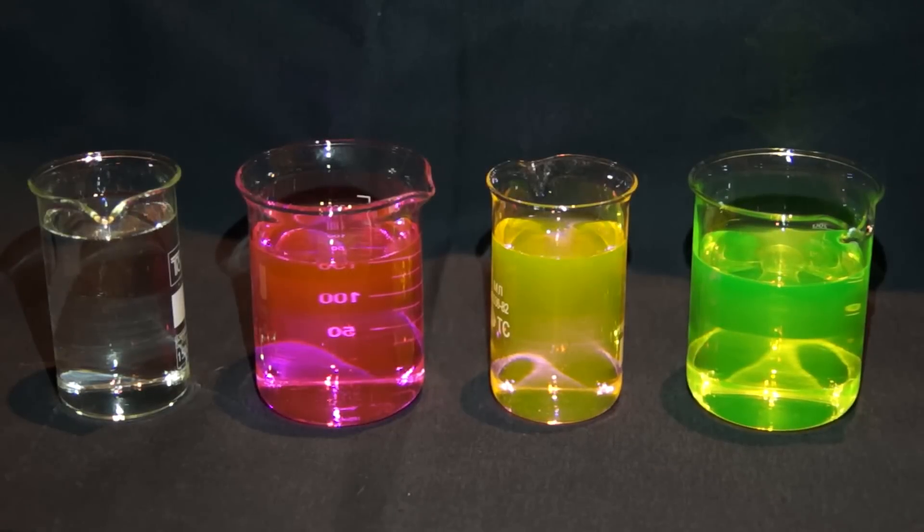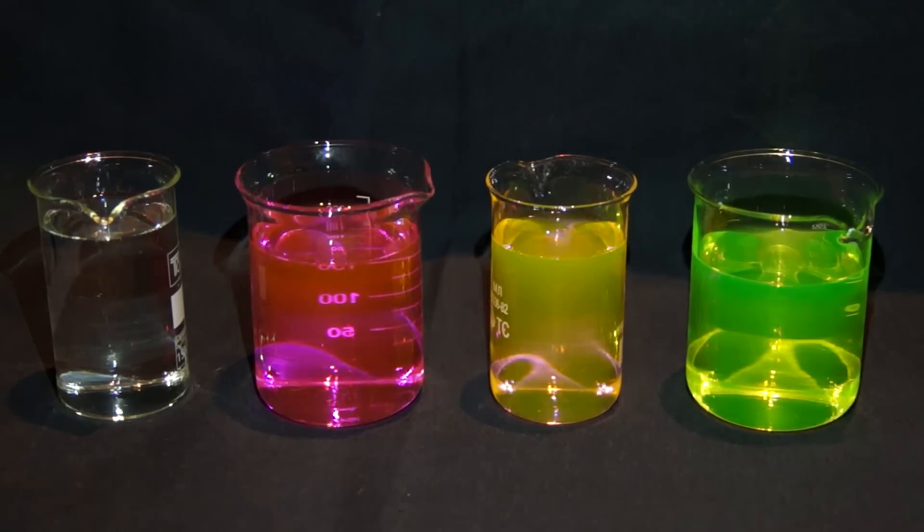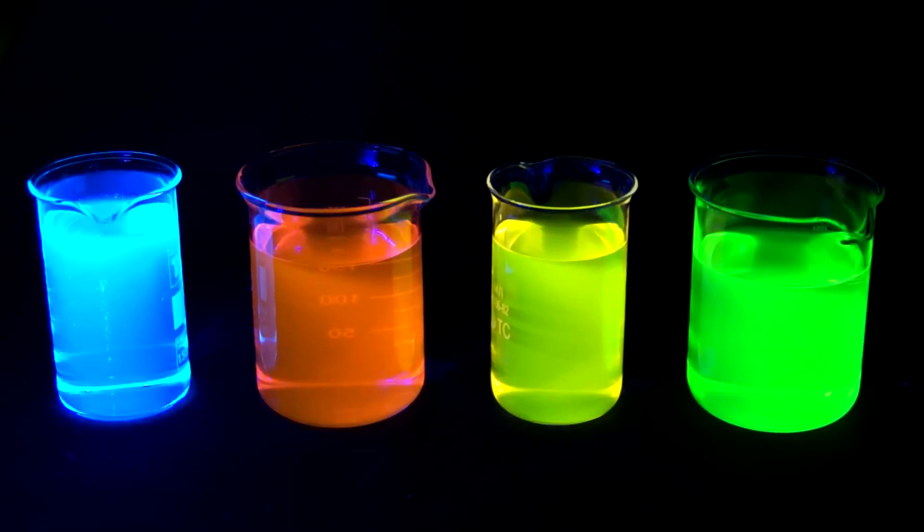At the moment we are observing the solutions with fluorophores in normal light. However, let's turn on the ultraviolet light lamp.